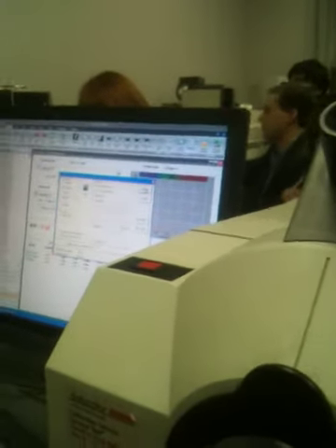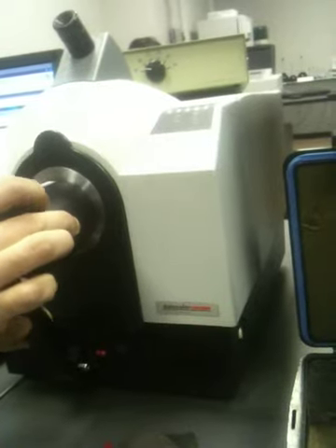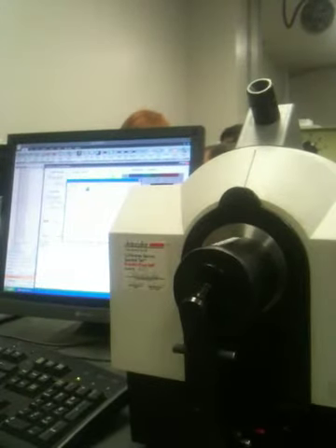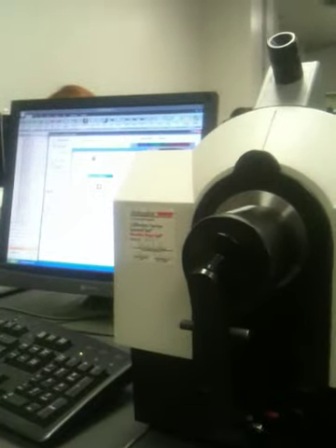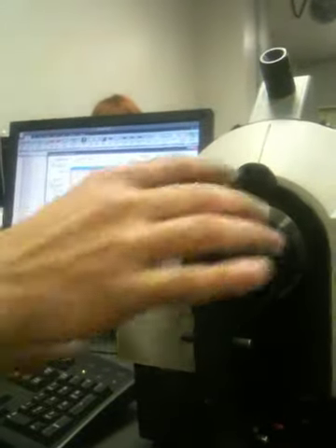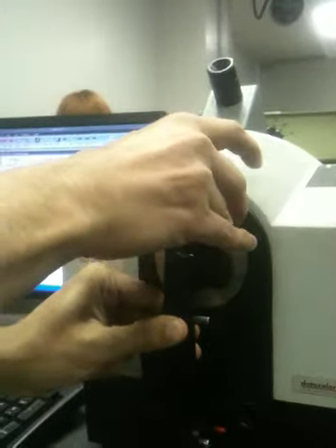Now let's talk about the calibration. We put in the first calibration and it says set black trap. Now it says face up forward. We are putting it in. Ready. You're hearing the sound, which means the light is flashing. Now it says set white tile. So it's green.